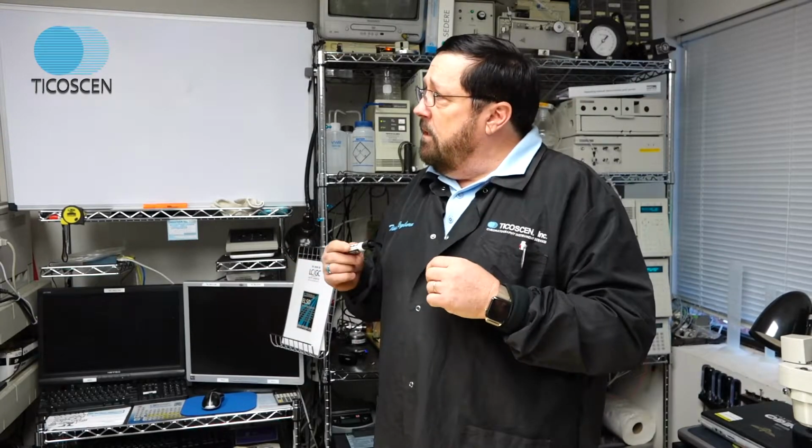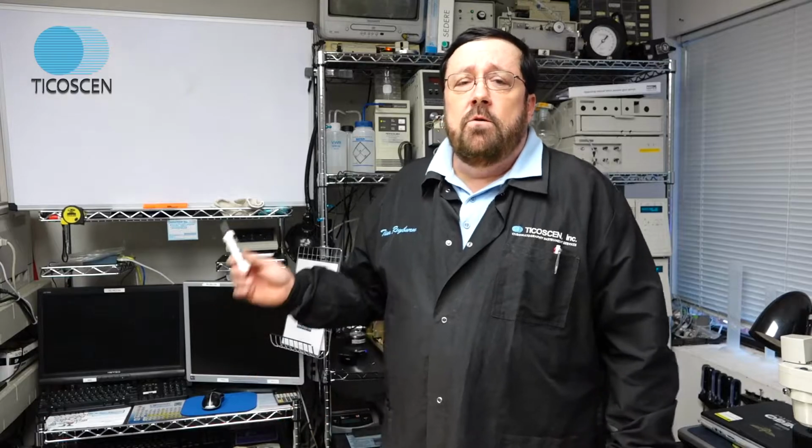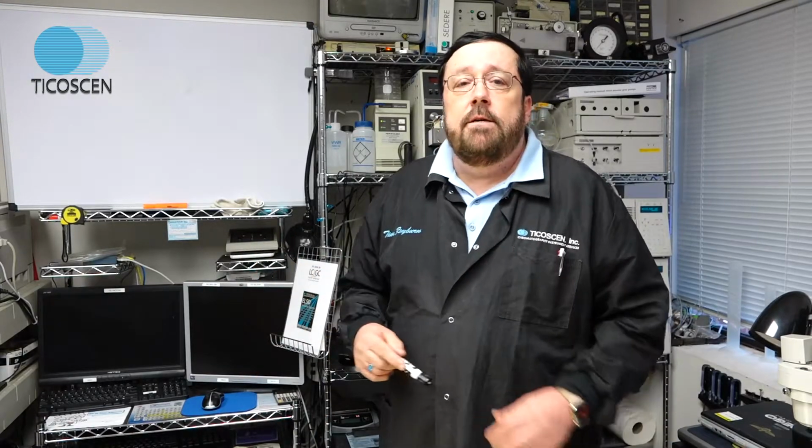So I think there's a couple solutions to this. I have a new solution I'm working on, which will be coming very soon, so keep an eye out for it. But before that comes out, the best thing for you to do is to change your water religiously. Change it daily. Every 3 days, depending on where you are in the country. You know, if you're in a more tropical environment, you might find the water goes bad overnight. What it'll do for an ELSD is it'll cause increased turbidity.